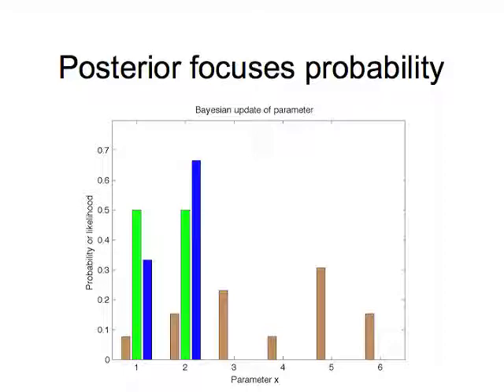What you might notice is that this concentration of probability is now more focused on the first two allele pair candidates, and there's an increase. Because it's a list-based method, we still have equal likelihoods, and therefore the two blue bars in their probability are proportional to their prior probabilities shown in brown.